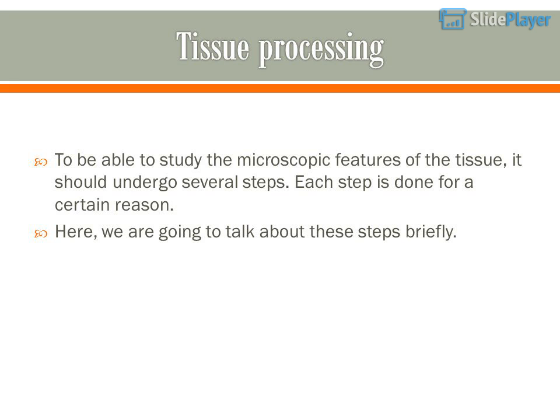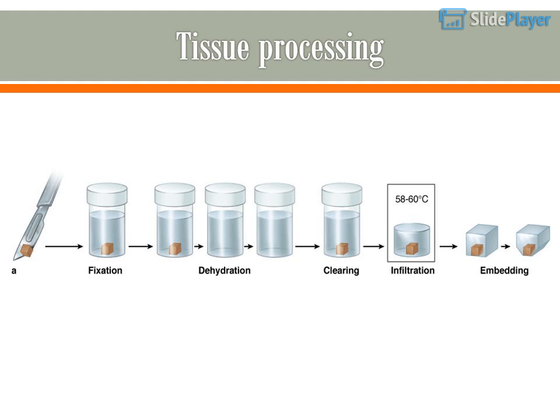Tissue processing. To be able to study the microscopic features of the tissue, it should undergo several steps. Each step is done for a certain reason. Here, we are going to talk about these steps briefly.